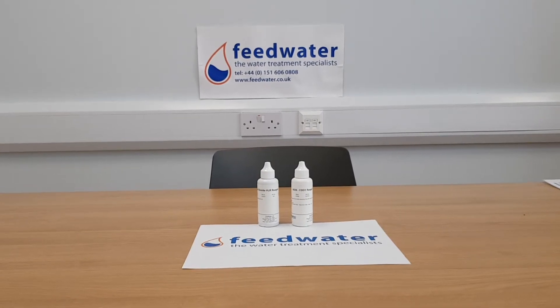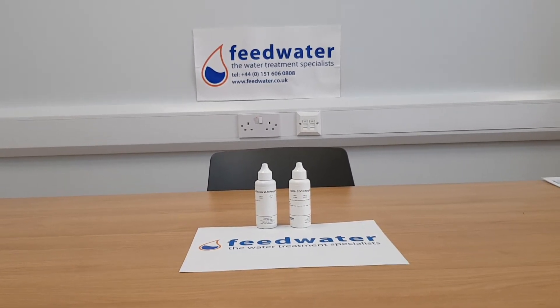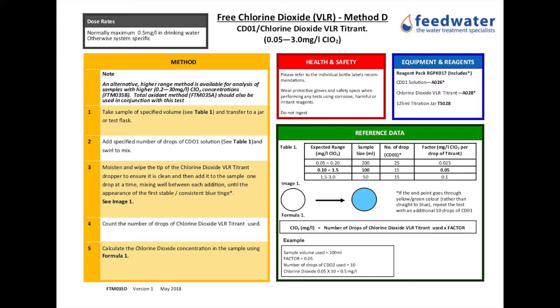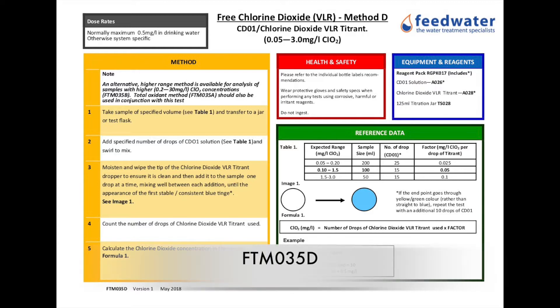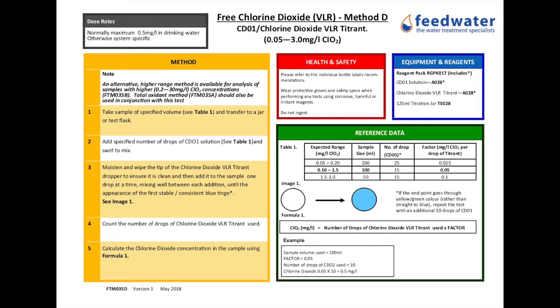Today we are going to demonstrate a field test method for measurement of free chlorine dioxide in water. This is a titration method and the reference code for this method sheet should you need to request it is FTM 035D. The UK Health and Safety Executive Guidance Document HSG 274 Part 2, the control of Legionella bacteria in hot and cold water systems, indicates that for Legionella control a free chlorine dioxide residual of at least 0.1 mg per litre should be maintained at the outlets.